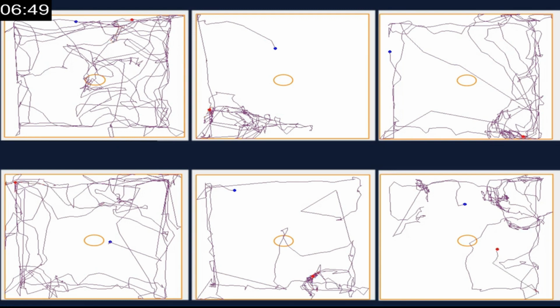And third, the quantity of feed eaten by each animal during the experiment. So these parameters you have to record while performing this experiment. This is all about the novelty feed suppression test.